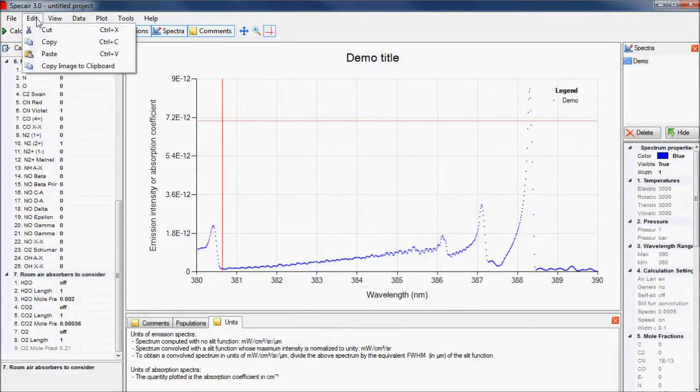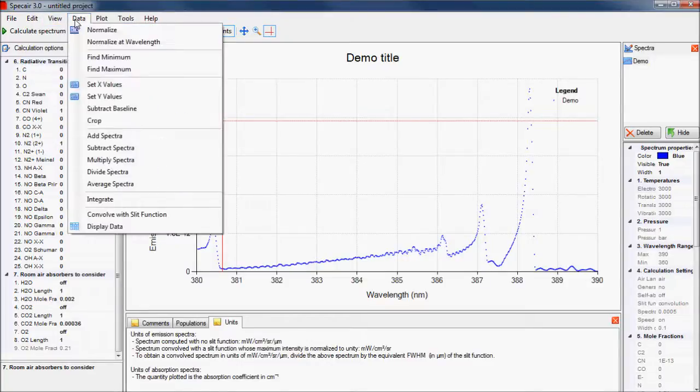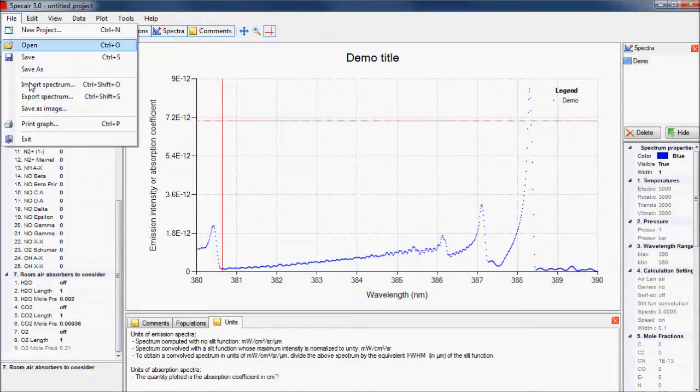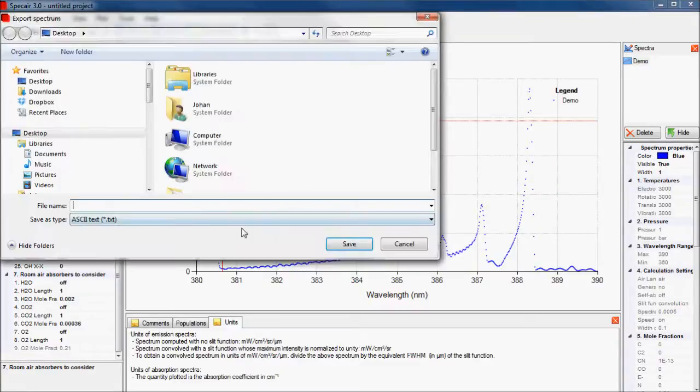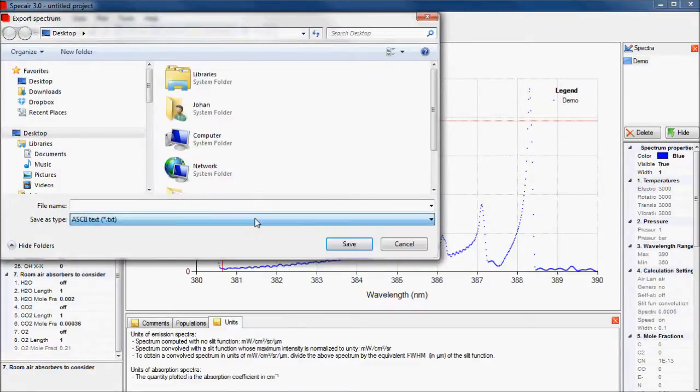This plot can be copied directly to other programs. The raw data can be accessed under the data menu and shown in a table, and the data can also be exported in several file formats for further use in other applications.